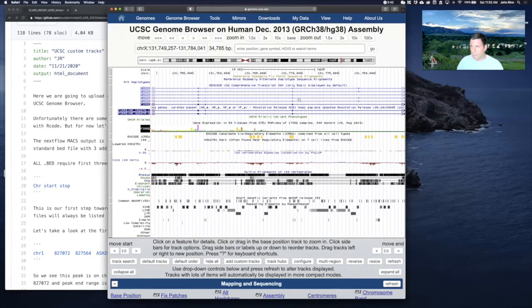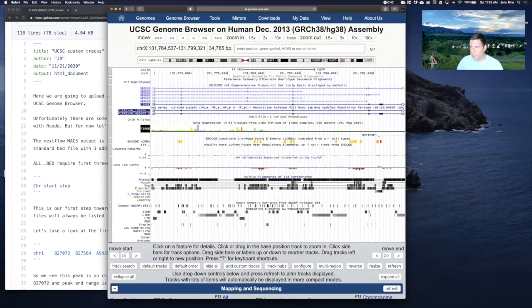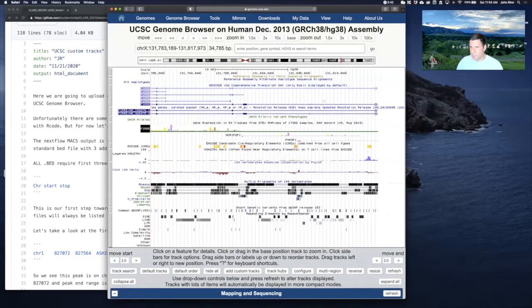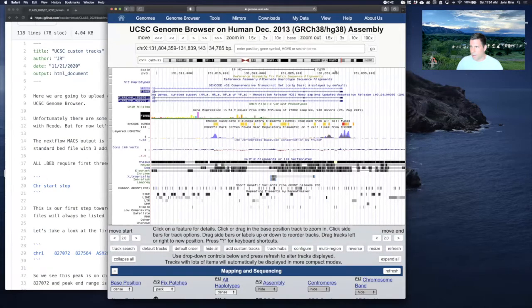And we'll get into what all this data is, but here you can see the annotation for the gene. And similar to IGV, you can hold down and scroll until we find the promoter here. So we're close. This is the gene, and the arrows are telling you which direction the gene is going in. And so we can scroll a little further and still further yet. And now we can see the start of this gene.